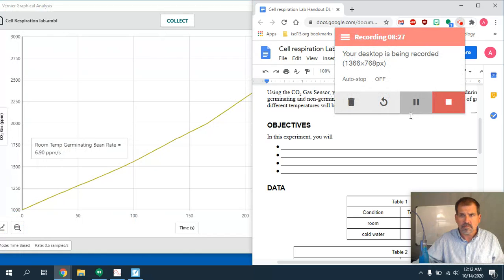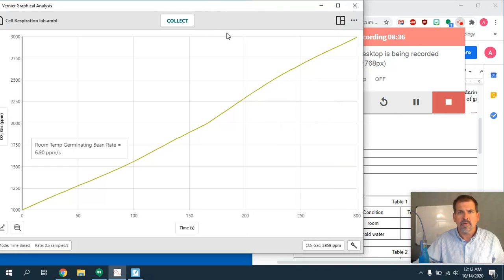All right, students, so all I really did was let the test complete its run. So it ran for 5 minutes. We just paused it for a couple of minutes to let it finish out.